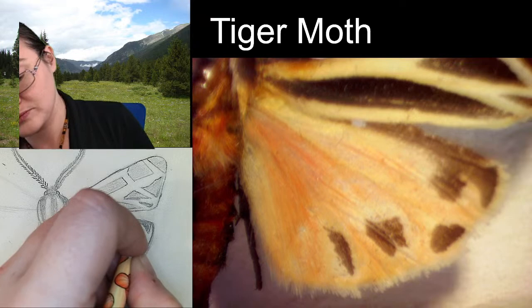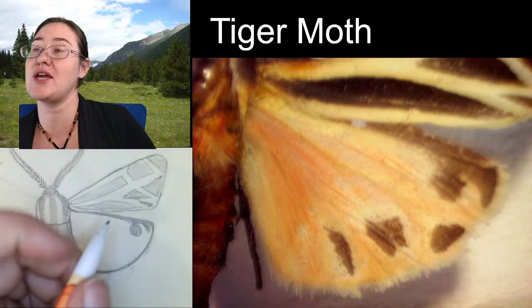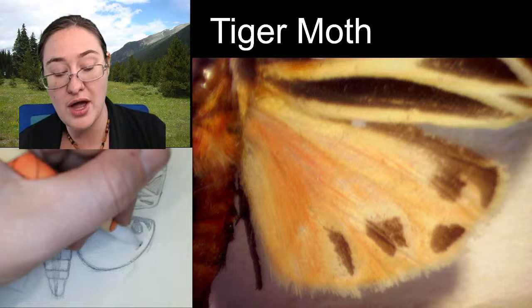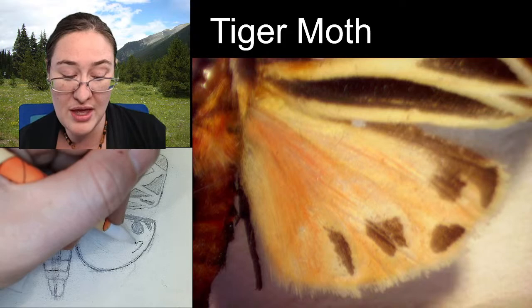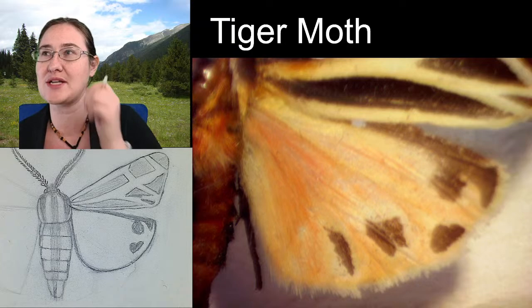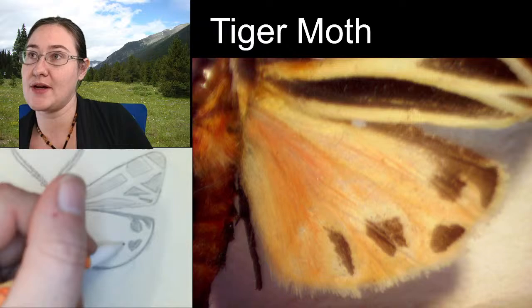Now, the locations and number of the spotting on the hindwing is how we're going to identify this species. Even though it varies by individual, the overall number of spots, the darkness of the spots, and the locations are going to help you identify them. All right, let's see. This piece almost looks heart-shaped, too.